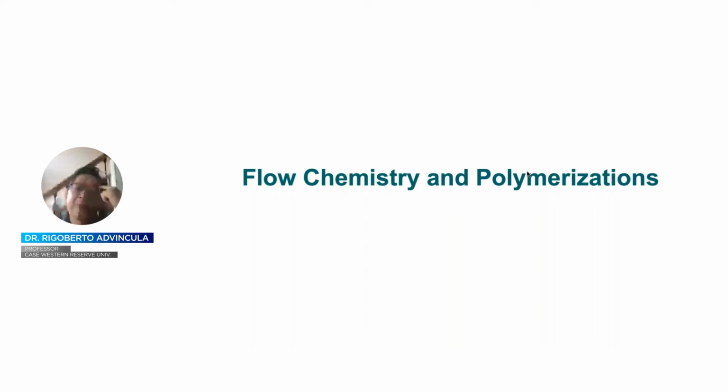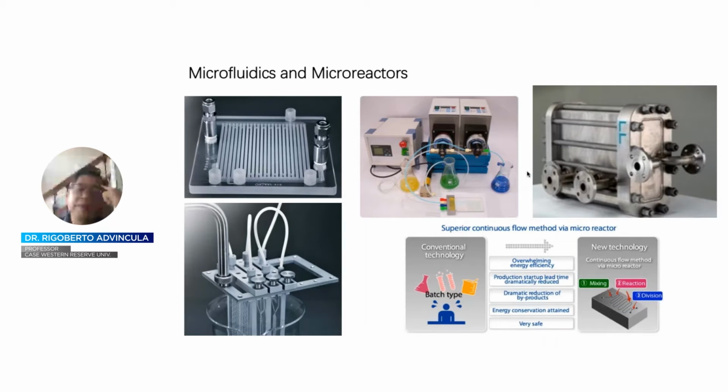So just to give a backdrop on the interest in flow chemistry, a lot has been investigated in the area of microfluidics, microreactors, or the use of different flow conditions that somehow simulate what would be found in a large engineering project or in the realm of chemical engineers as they run plants, beyond pilot scale, but production in petrochemical plants, for example. Now, all of this can be done at the bench scale by relying on controlled flow conditions with control of temperature, pressure, and even surface area.